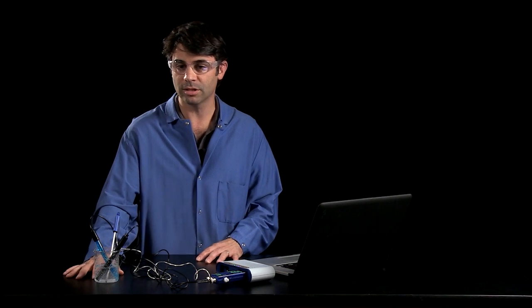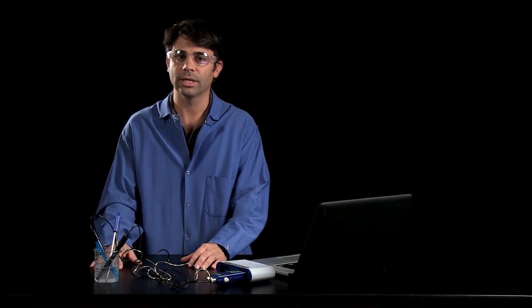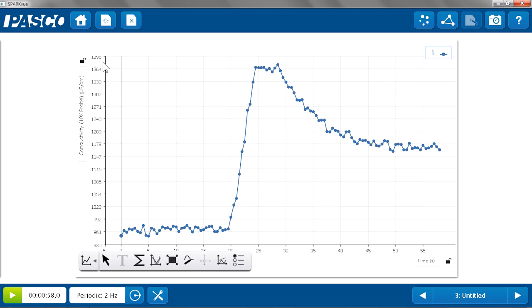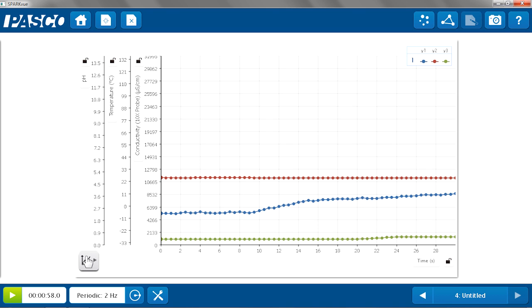You can really get at a lot of the chemistry concepts with a very simple system as long as you can make all those measurements. And that's what the advanced chemistry sensor allows you to do. Now, the really nice part about this is, since I was making those measurements simultaneously, I can view all of them on one graph. And I can make connections between what was happening in each of those properties. We'll look at our next page and autoscale it.